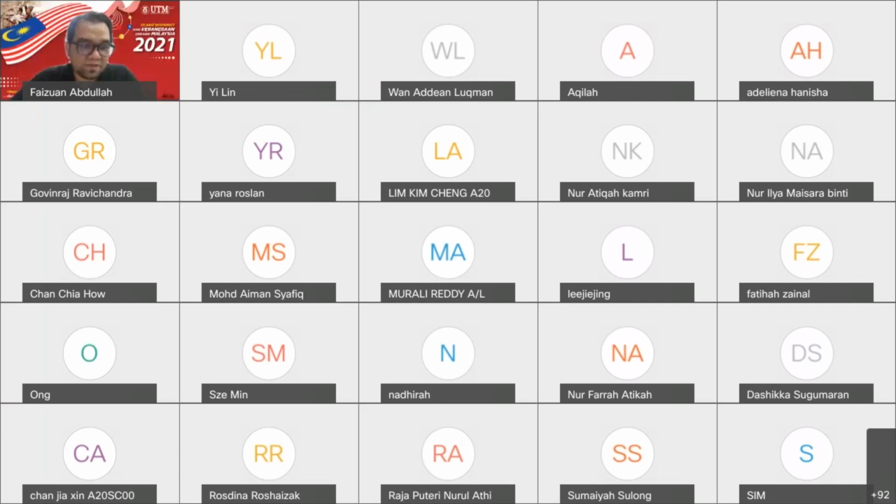And what is V1? We don't know yet. That is the volume we need to find. We already know our aim: to prepare 100 ppm of zinc solution in 100 mil.